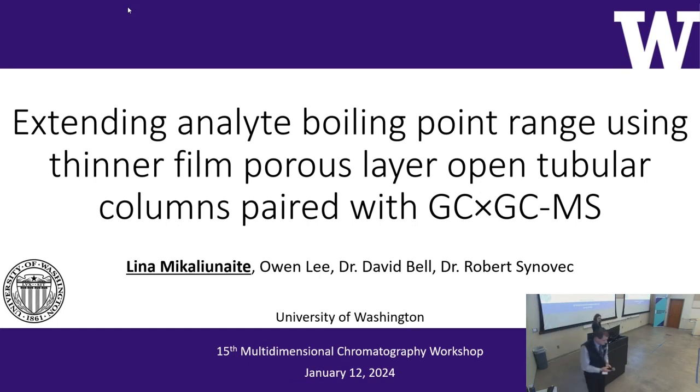Thank you for that introduction, and thank you to the committee for letting me share two of my research projects while I'm here. While you heard from Rob, and if you visited my poster, I was talking more about my computational work, here I'm going to talk more about the instrumental side of my PhD. And really, I'm going to be getting into PLOT columns.